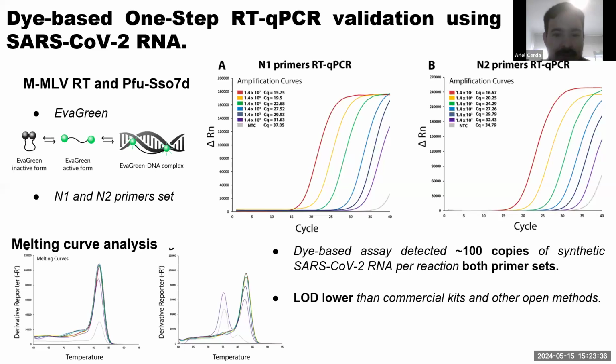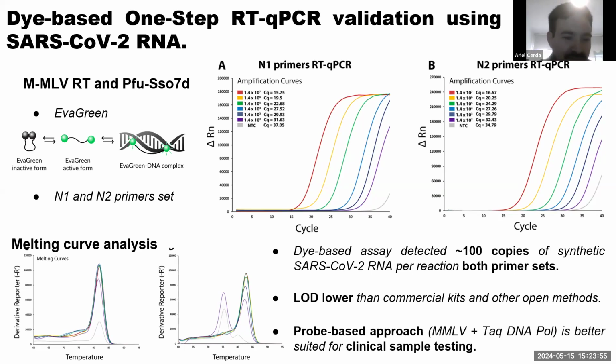Moreover, we observe non-specific amplification in non-template control and low concentration RNA samples, likely due to cross-contamination or primer dimers, despite the efforts to optimize this master mix. We consistently obtained this kind of non-specific amplification. This resulted in the recommendation of the clinical laboratory that we are working with.